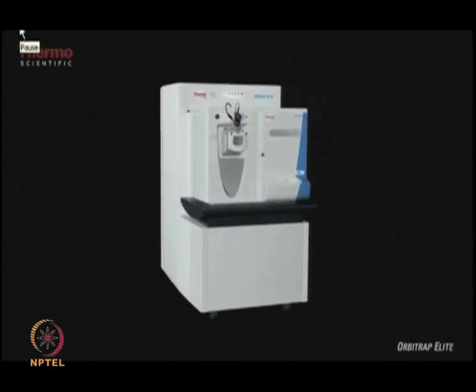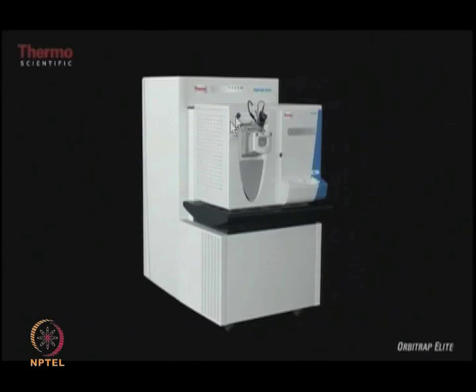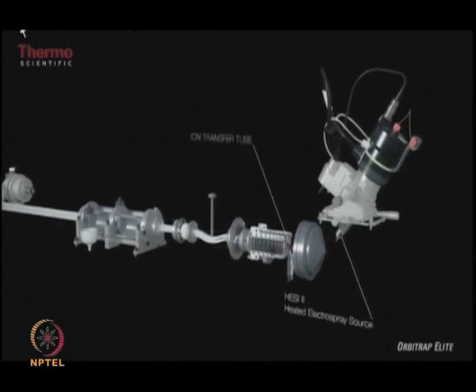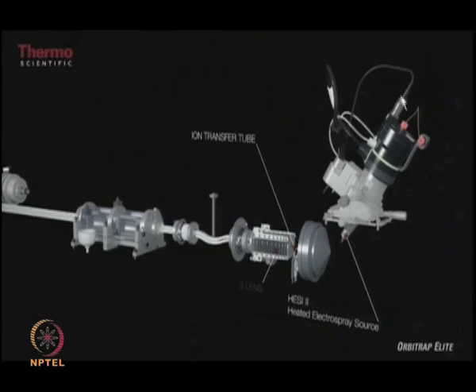The mass spectrometer which is sitting in front is a linear trap, that's an LTQ Orbitrap Velos, and then the back end is the high field Orbitrap, also called the Orbitrap Elite. If you look at the schematic of the system, in the front part of the system is the ionization source, which sits on the front.